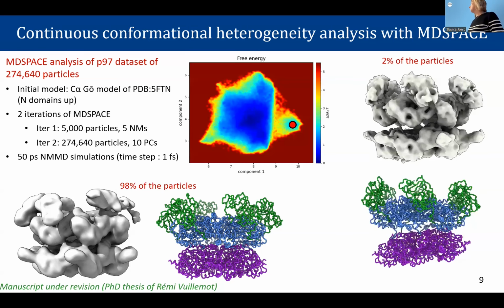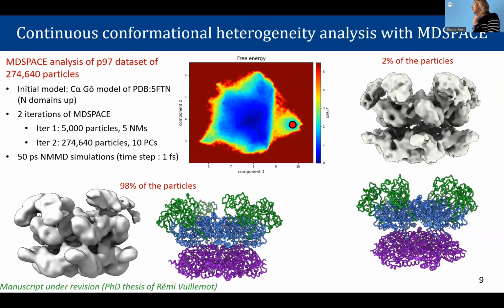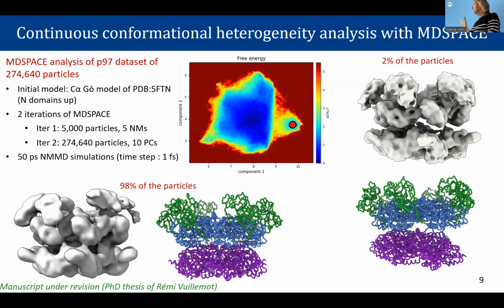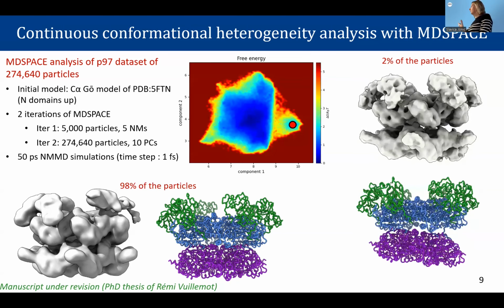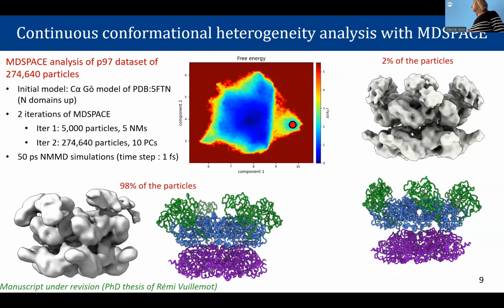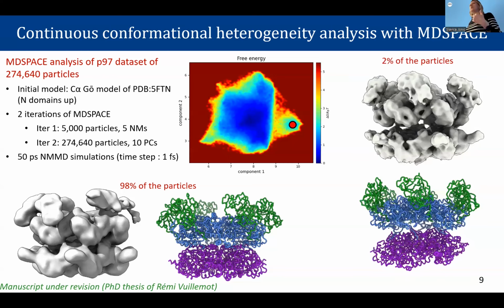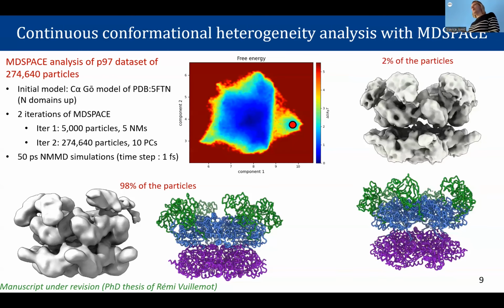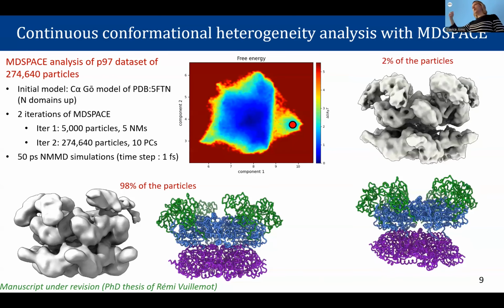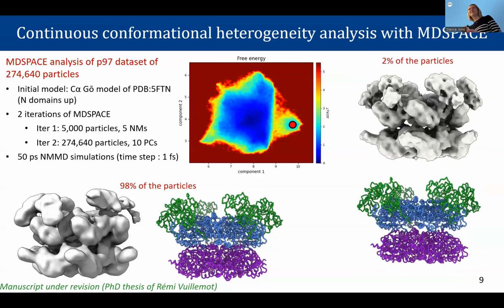But what I wanted to show you is that, okay, we speak about atomic models here, but actually this representation here in Chimera, these two, this is not really atomic. For people who know, they immediately recognize, because usually when you see an atomic model, then you see alpha helices, beta sheets, and things like that, for the people who know what I'm speaking about.